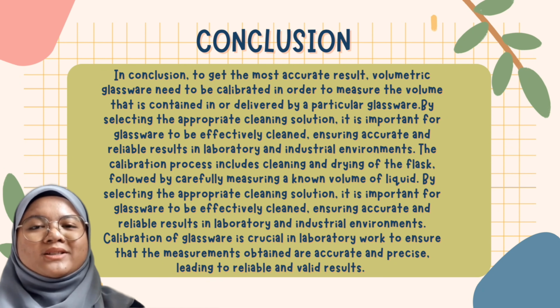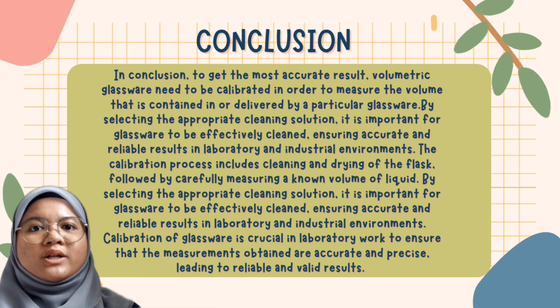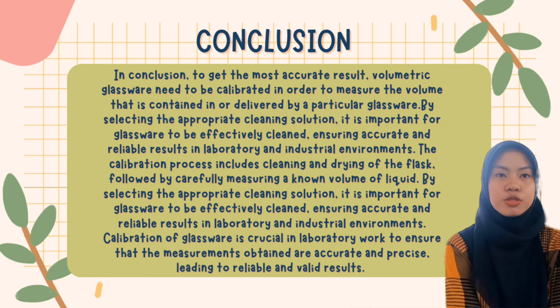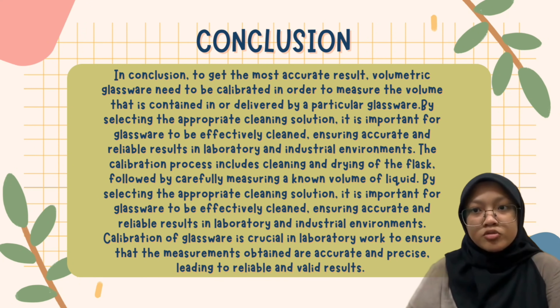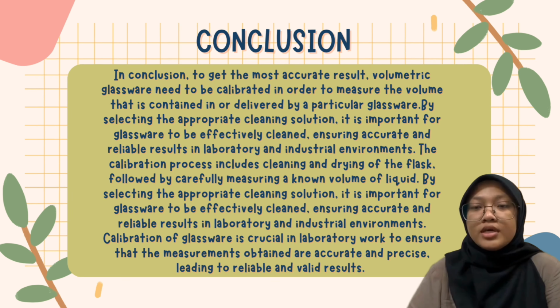The calibration process includes cleaning and drying of the flask, followed by carefully measuring a known volume of liquid. So, in conclusion, by selecting the appropriate cleaning solution, it is important for glassware to be effectively cleaned, ensuring accurate and reliable results in laboratory and industrial environments. Calibration of glassware is crucial in laboratory work to ensure that the measurements obtained are accurate and precise, leading to reliable and valid results.